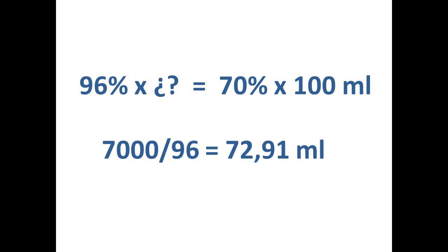We just need to add the rest. It means 27 ml of water to this alcohol 96% and we will have it in 70%. How we do it?